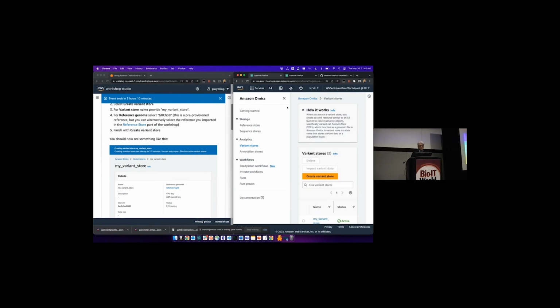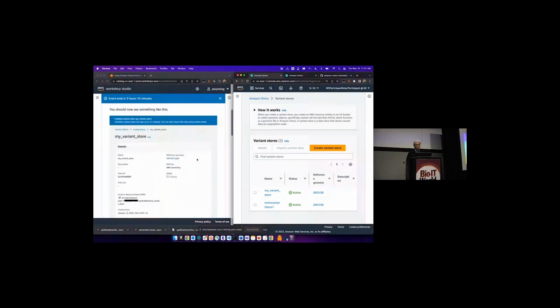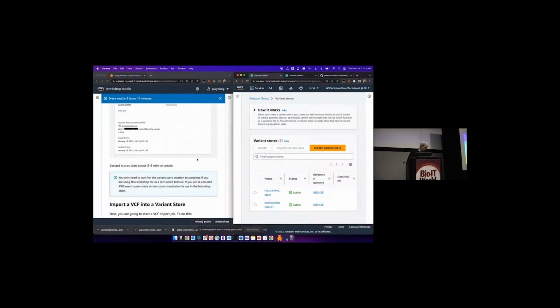Could we configure a workflow to export content? You could, if you wanted to. You would have to add a step.